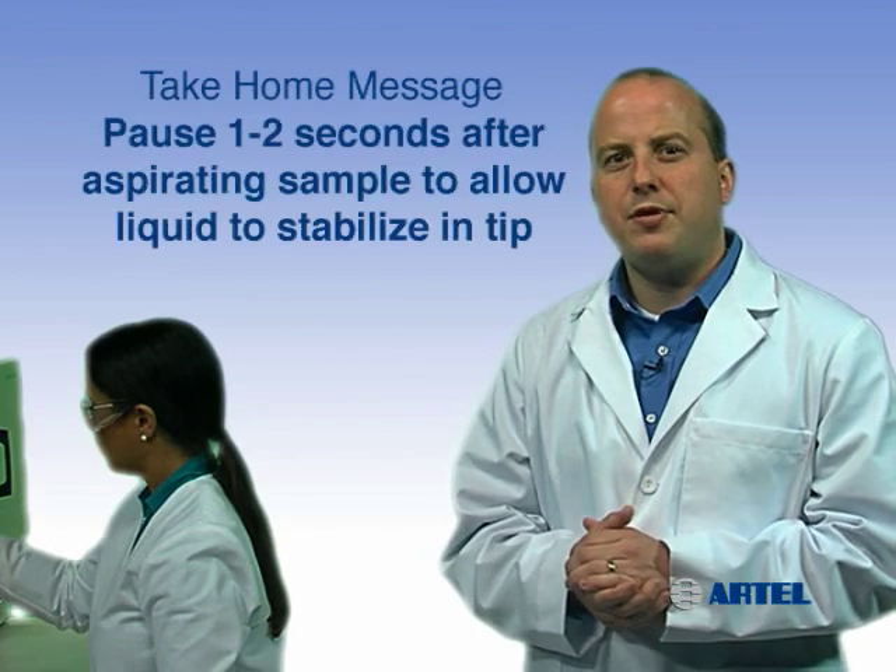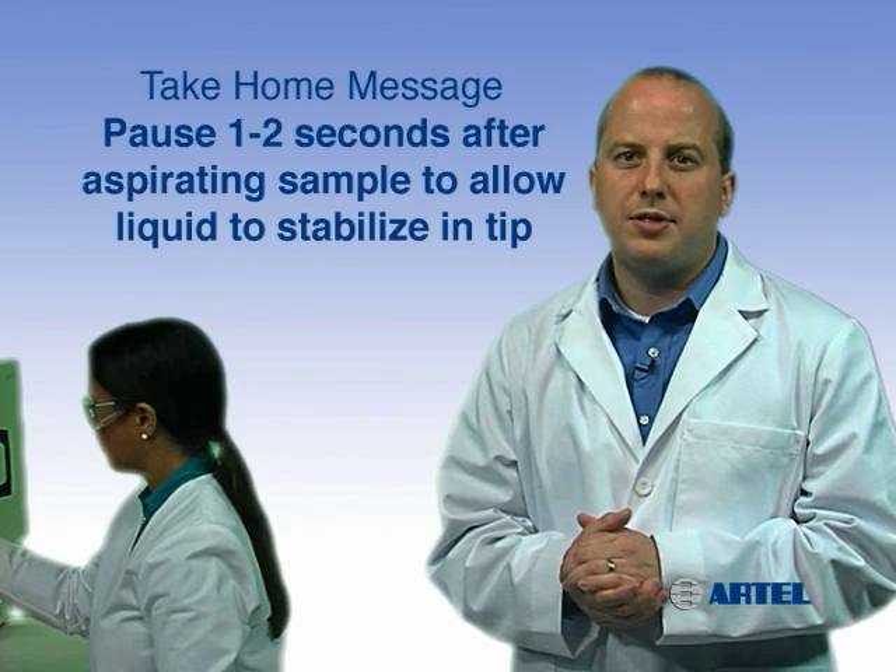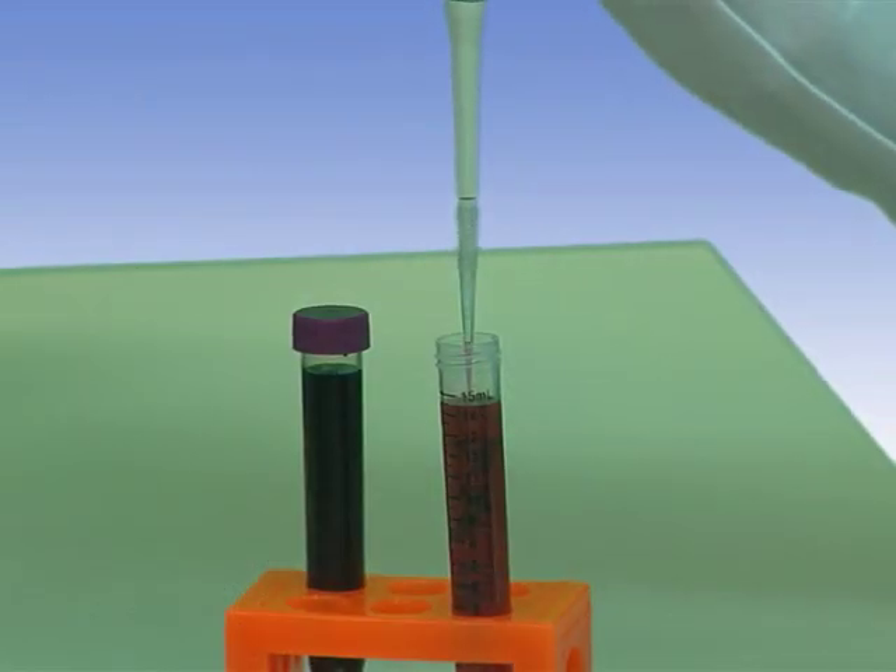The take-home message is: slow, even plunger release and a consistent one to two second pause after aspiration will allow the liquid to stabilize inside the tip.